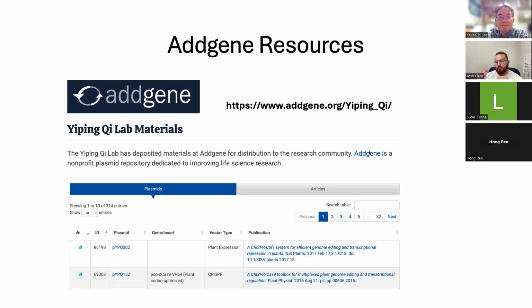So I drive all of the genes together if you are interested in driving them with the same relative level of expression under, say, a strong polymerase 2 promoter like maize ubiquitin. I flank each gene with a T2A or P2A ribosome skipping peptide, and you drive it as a polycistronic mRNA. So I've driven over 5 different Cas genes like that, and that seems to work efficiently and effectively.